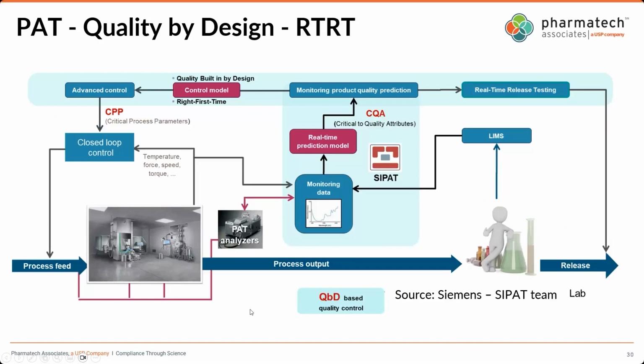You have to see that the complex equipment is just one picture here on the left side, but behind that is the data transfer, data exchange, analytics, chemometric models, etc. So I'm always a bit afraid, saying: do we not create a kind of fatigue by putting all of this complexity on a system whose purpose was actually to make things easier and simpler?